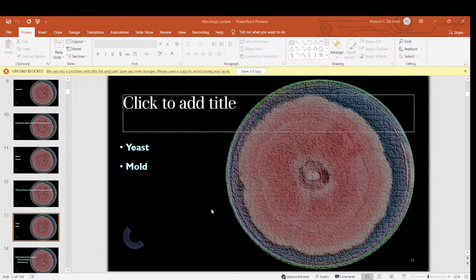All right. Sorry, I'm currently in the laboratory right now, but it's not very toxic. Okay. So let's differentiate the microscopic appearance of molds and yeast. Basically, molds are seen in the form of hyphae. Hyphae are elongated structures that branch out. We'll talk about them later on when we get to the specific discussions.